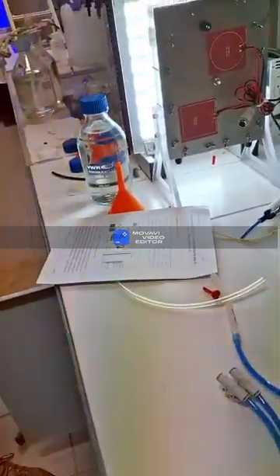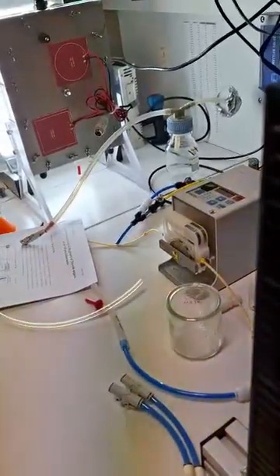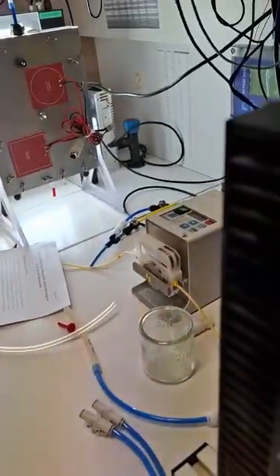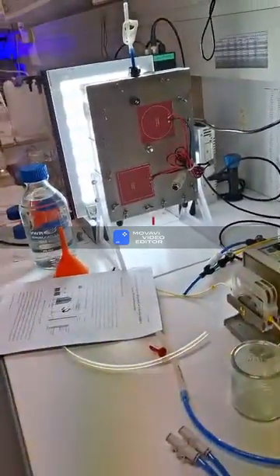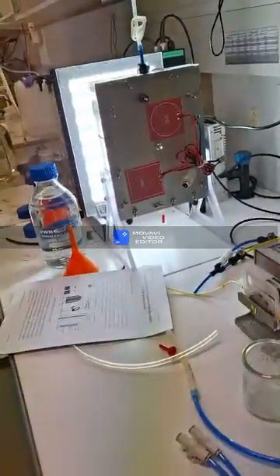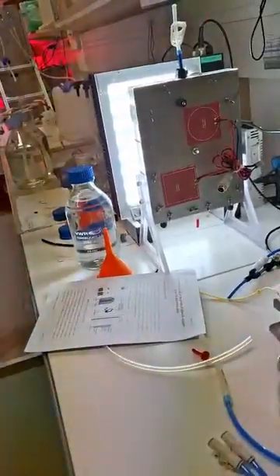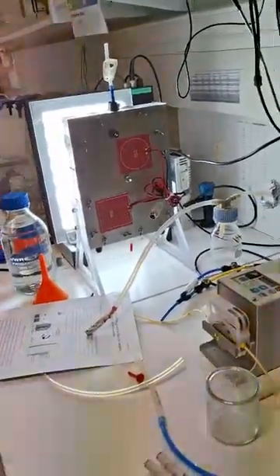Here is another bottle, just to avoid foam formation from the algae, because sometimes you have a lot of foam and the filter can be stuck and the air cannot escape. So you will have an overpressure just here, and you will have leaks or explosion of the system. So it's a security. It will just contain foam.